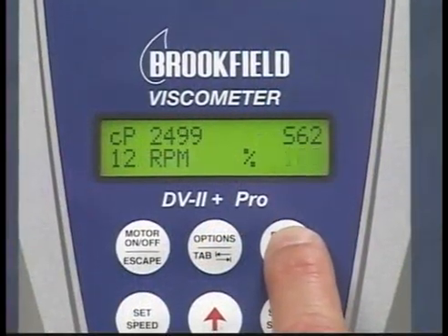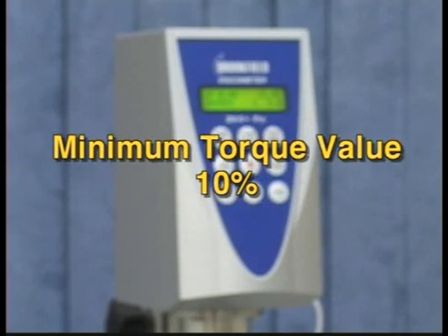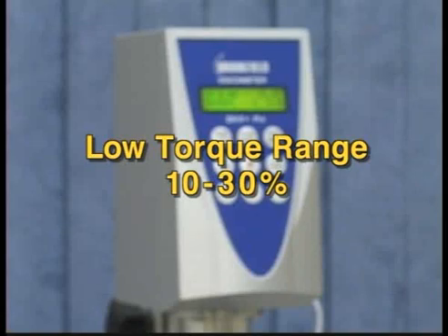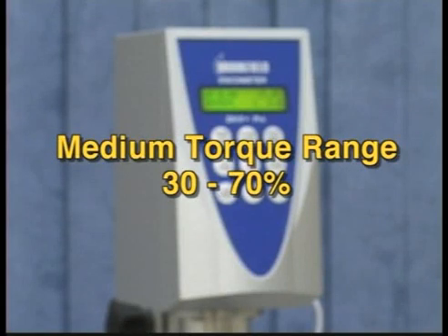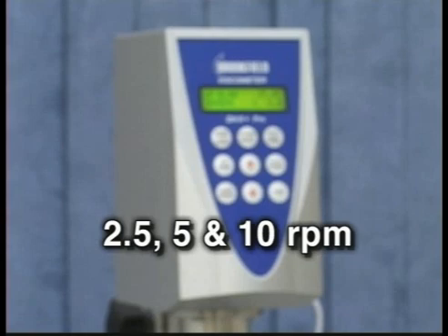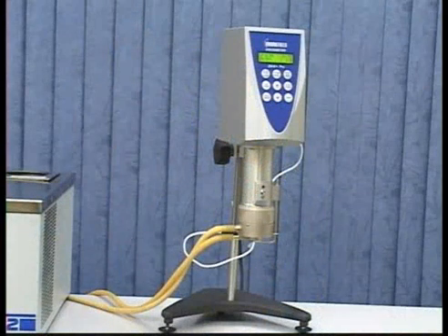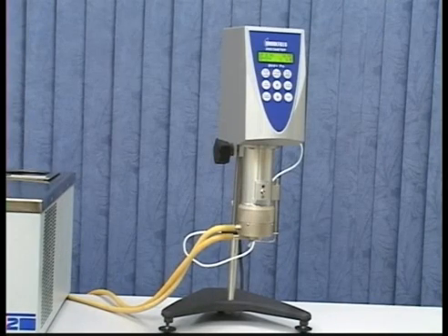With a digital instrument, you can easily find the full scale range by turning on the motor and pressing and holding the auto range button. For example, if you are using a 100 centipoise fluid, a full scale range of 200 centipoise will give you a 50% torque. The minimum torque value for a good reading is 10%. A low torque range would be 10 to 30%, a medium range 30 to 70%, and a high torque range above 70%. For this example, we will choose speeds of 2.5, 5, and 10 RPM. This will check the linearity of the spring on this instrument through its full range.